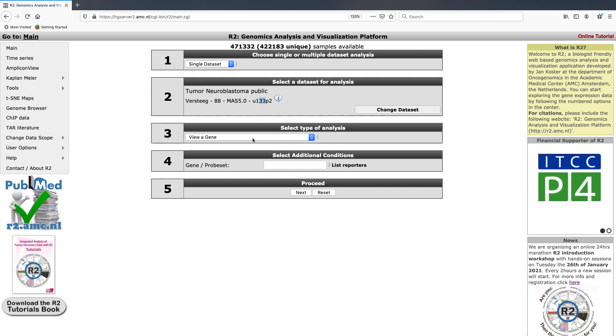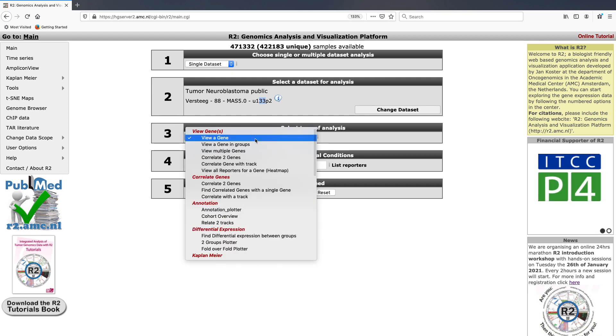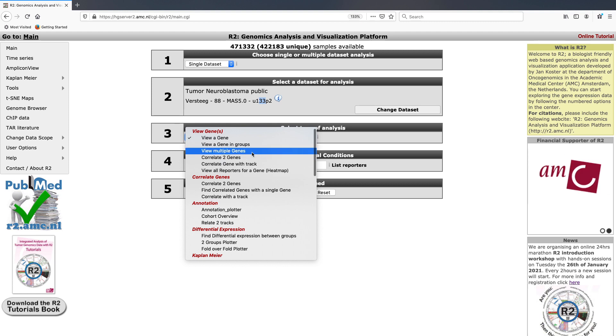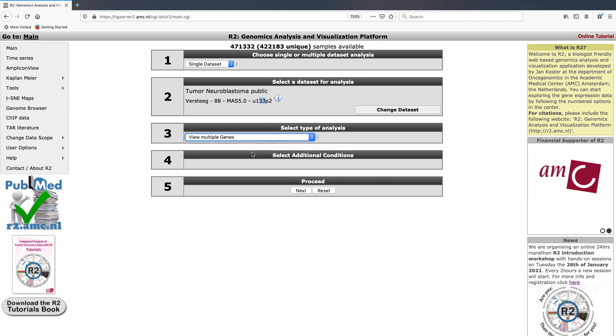We're going to select under the type of analysis, view multiple genes. So we're going to click next.